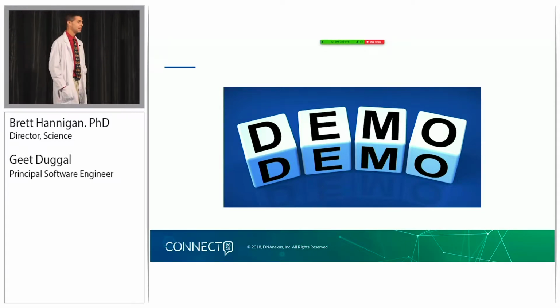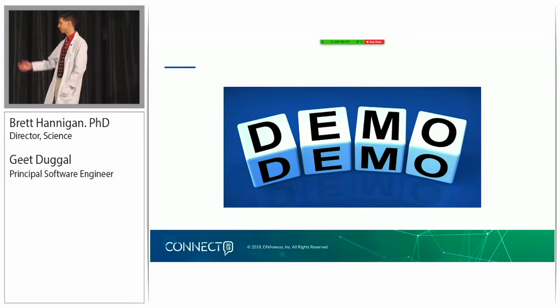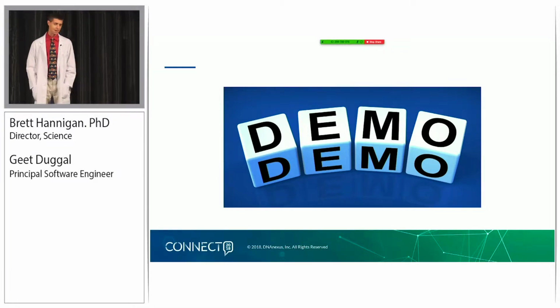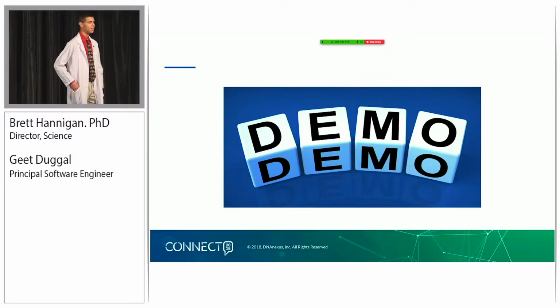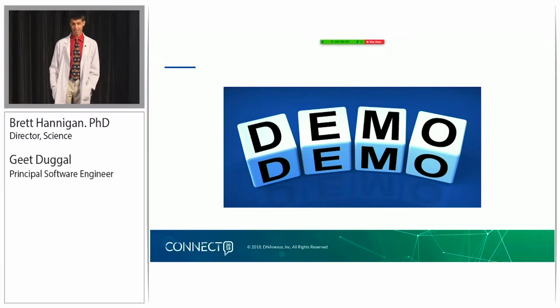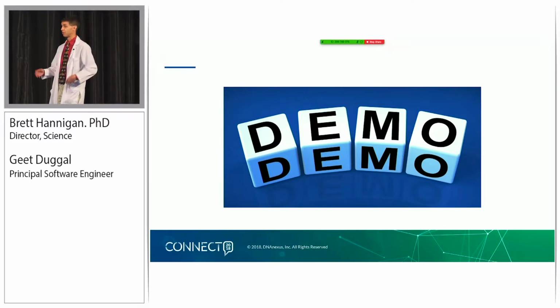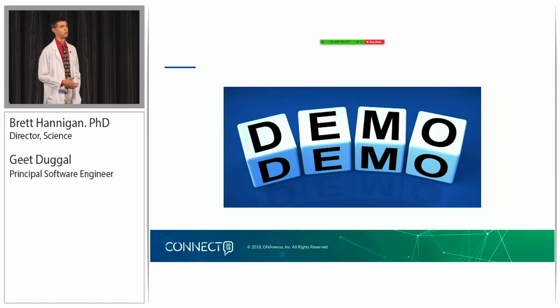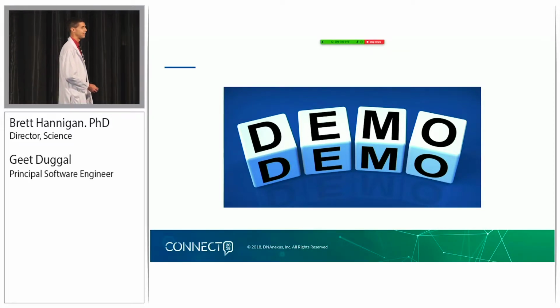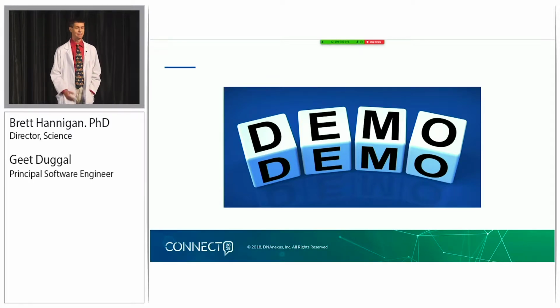and put that into our database as well. The scenario I'm going to set up is that Geet and I were standing together at lunch one day, talking about a new Cell paper analyzing a line of breast cancer data. When I was talking to Geet, I realized that internal to our organization, we had a similar data set, and I wanted to explore that data and see if we could recapitulate a number of the findings made in the paper itself.